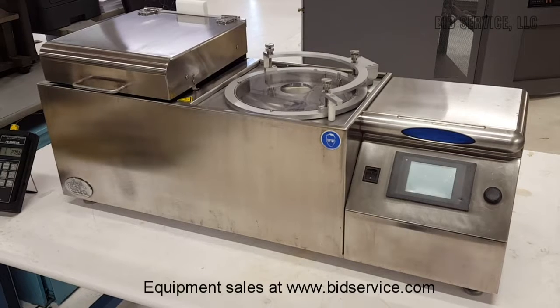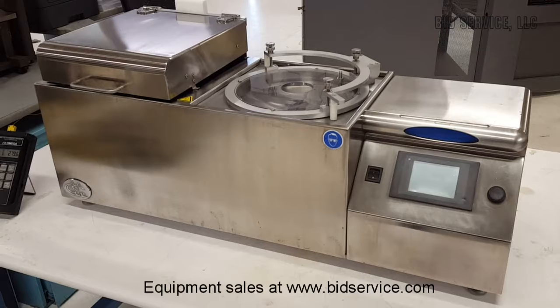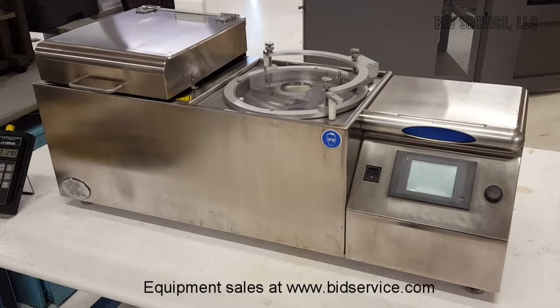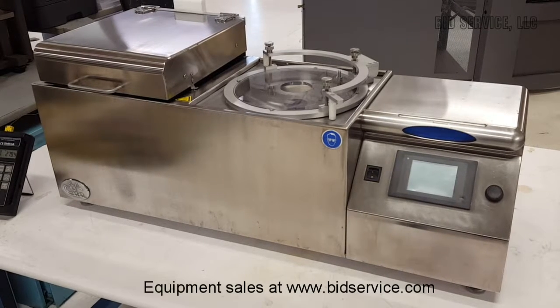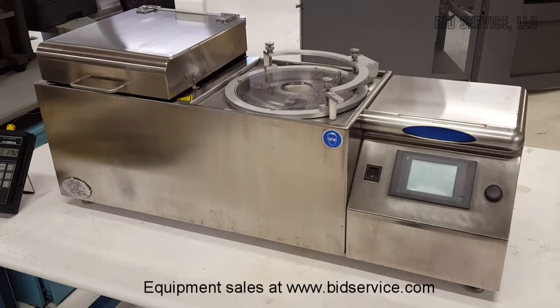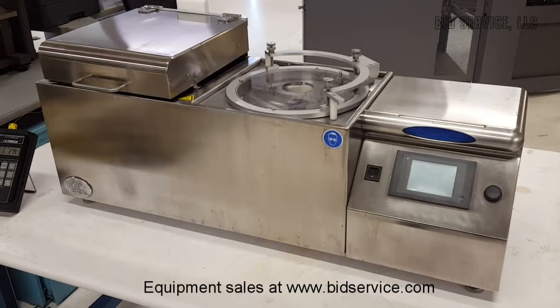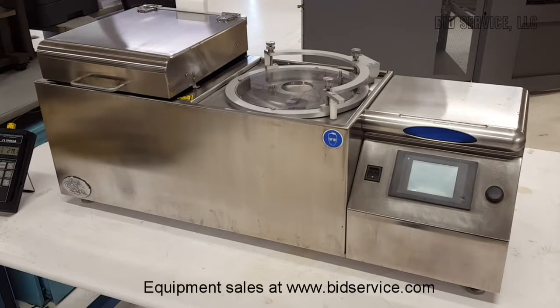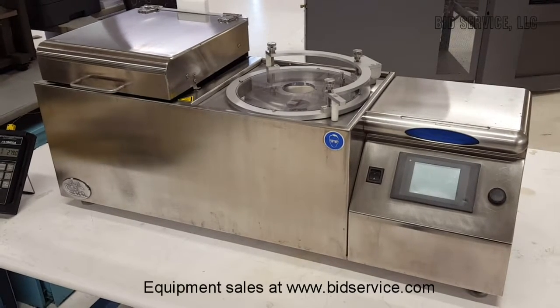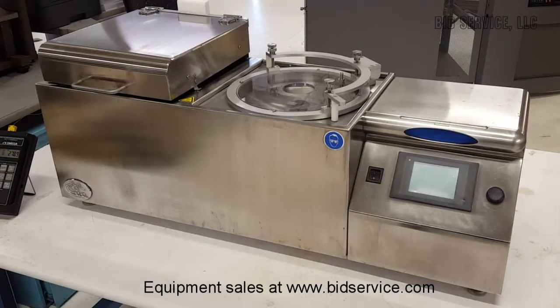With its convenient and user-friendly design, the C-200CB programs are easily entered, monitored, and stored. With its small footprint, the C-200CB is perfect for any low-volume or R&D laboratory processing environment. It has a maximum spin speed of 6,000 RPM, a maximum ramp of 30,000 RPM per second, speed accuracy of plus and minus 1 RPM, and a maximum substrate that will fit in the bowl of 200 millimeters.